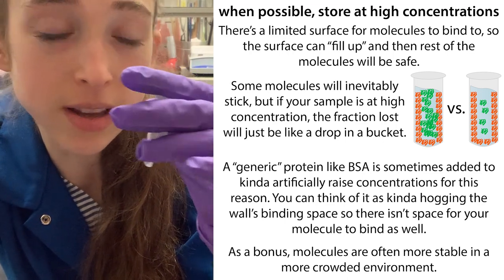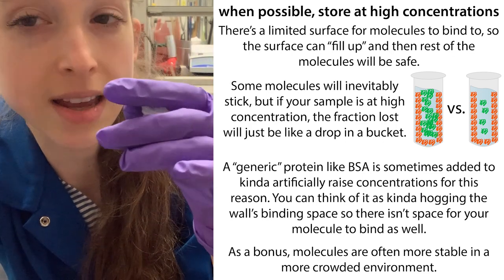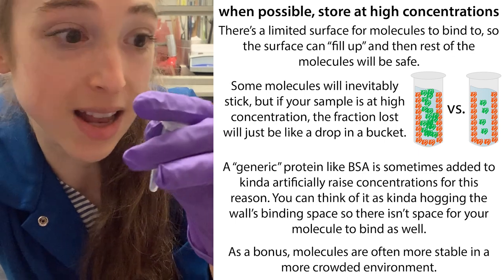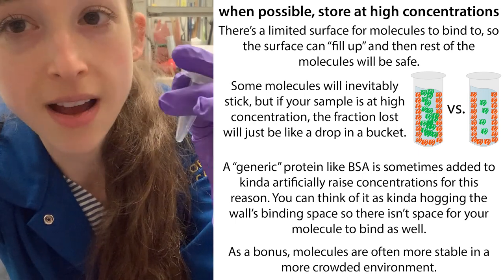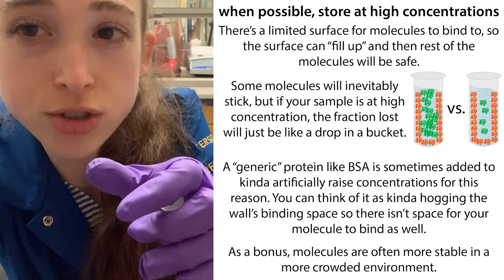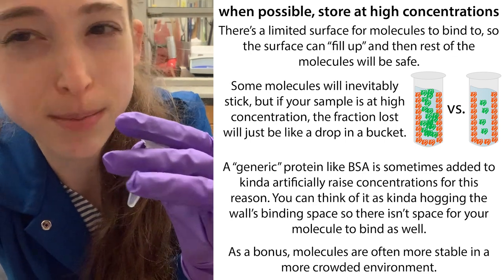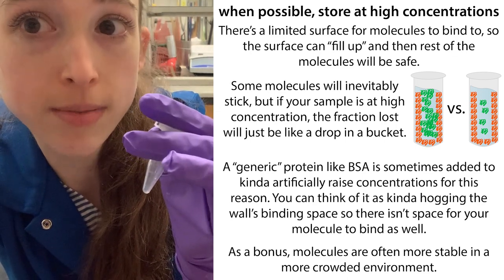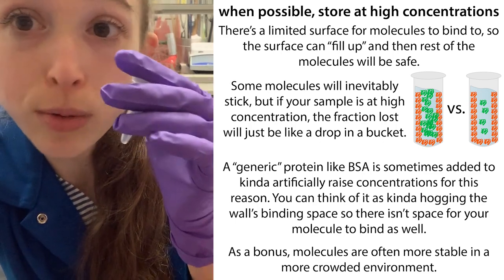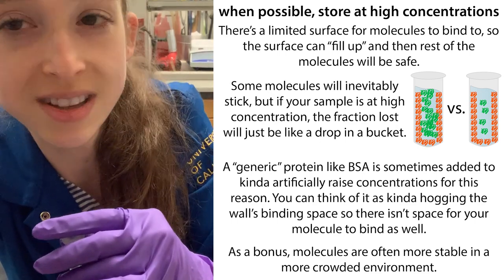Sometimes people add BSA — you might buy enzymes in a solution that contains BSA. There are multiple reasons for including BSA, but one is that it can coat the walls so that your protein is less of a proportion of the overall solution, and the BSA can hog the wall so that your sample doesn't bind there. Proteins are often more stable at a higher concentration — less likely to unfold, as they don't have as much space to stretch out.